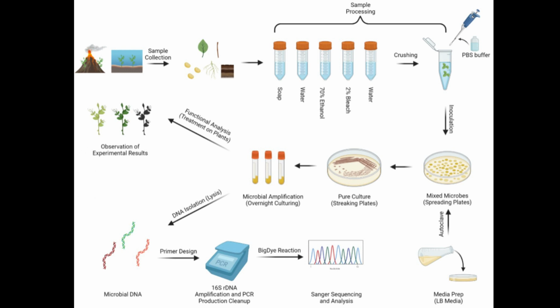A second test was done to test for silver reductase activity. This was done by adding 1 mM of silver nitrate. If a dark brown color formed, this meant that silver nanoparticles formed. The samples that tested positive were the same, VQ1, 2, 3, 4, 7, and 9.